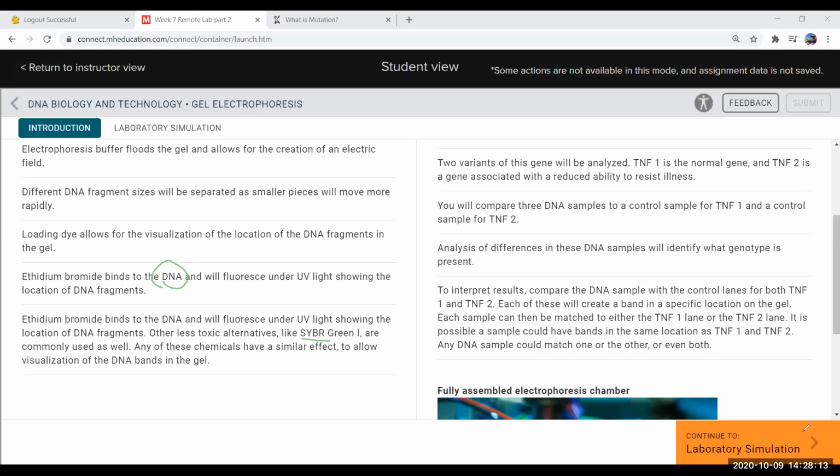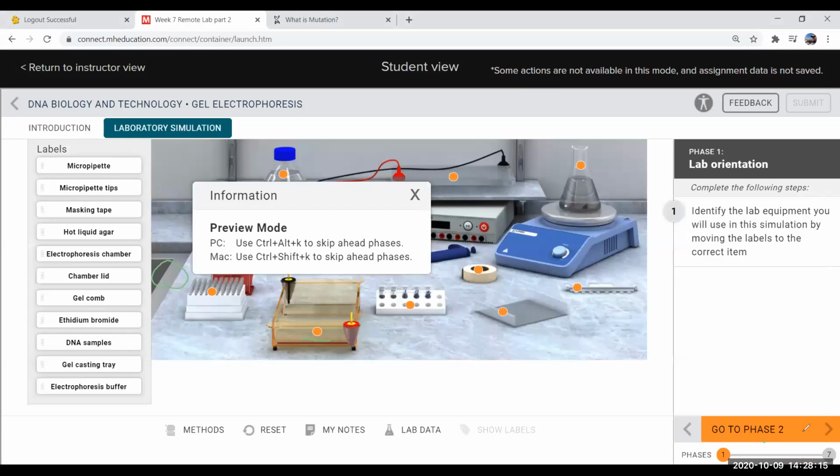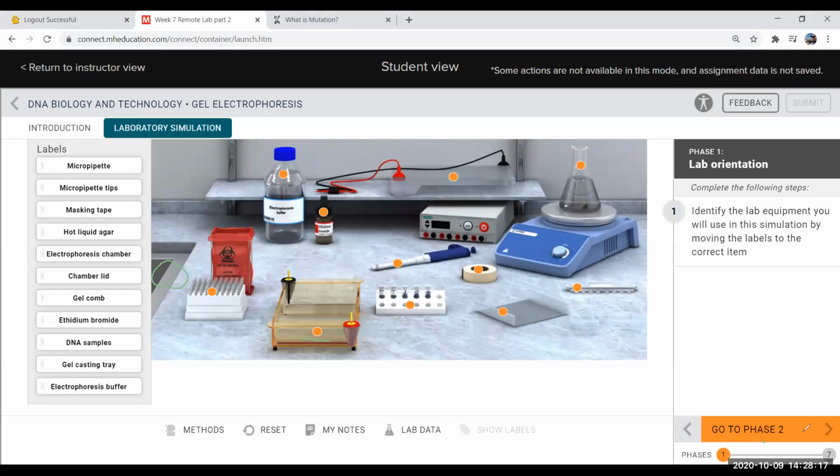All right, I'm going to help you with one little part. The very first part of this you may not know, unless you work in a lab. So what I'm going to do real quickly is show you the different things that we would be using. Remember I was telling you there's like a Jello mold that we use to make the gel? This is the Jello mold.